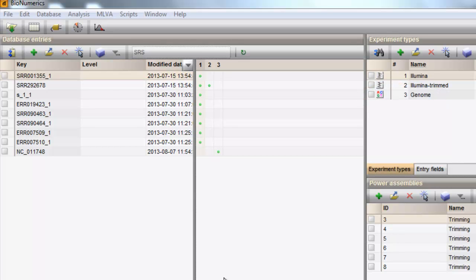We will start a resequencing assembly on the preprocessed dataset that was used to illustrate the preprocessing. We can open the experiment card for the data by clicking the experiment dot.